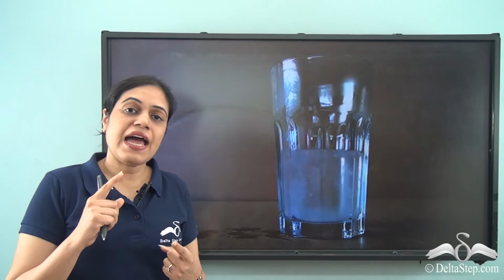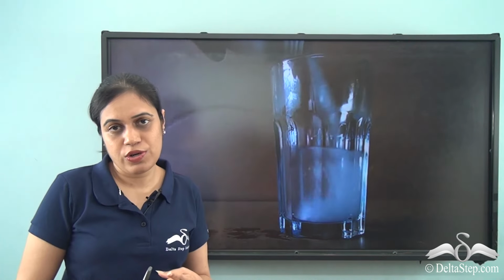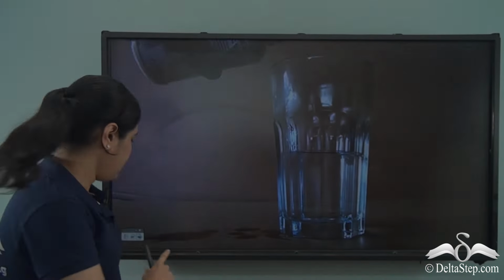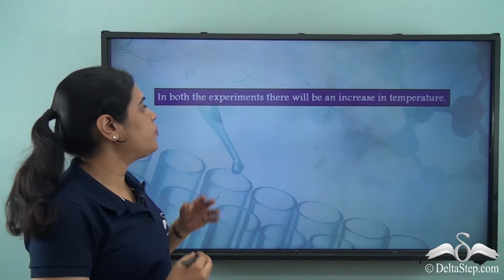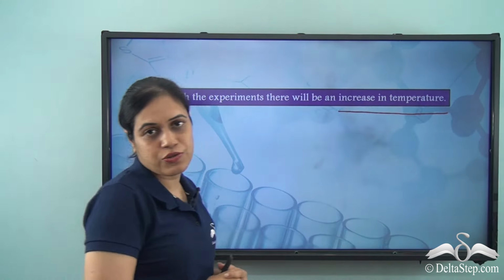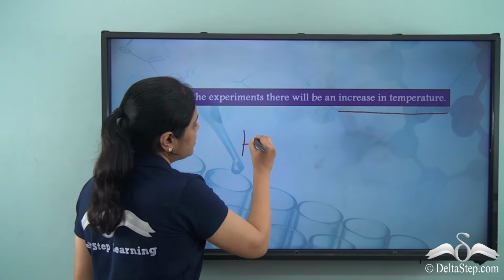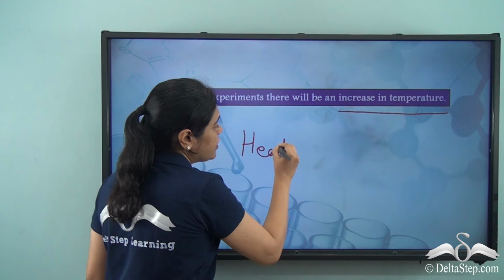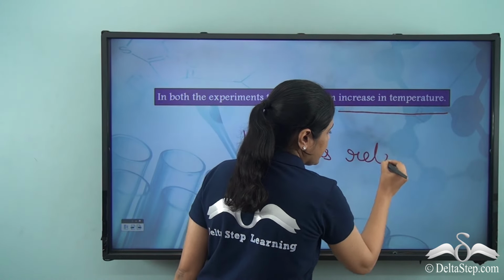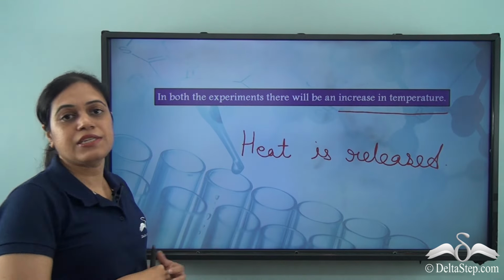So when we add acid to water or when we add base to water, in both the cases, the temperature rises. So we can conclude that in both the experiments, there will be an increase in temperature. Increase in temperature means heat is released.